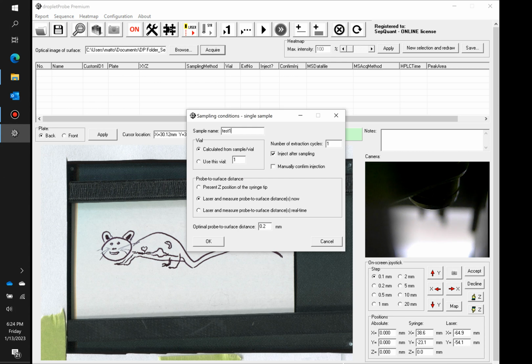In this case, I chose shift and left click on the heart, which only allows you to select one point. If I want to select multiple points, which I'll show you in the future, it'll be a grid or some sort of pattern, and I can fill multiple spots in the sample list. In this case, it's just one.